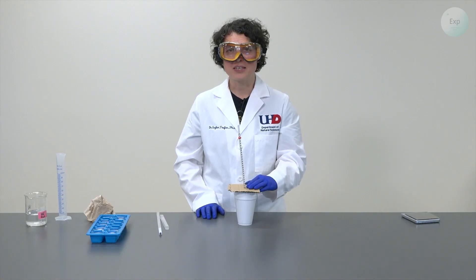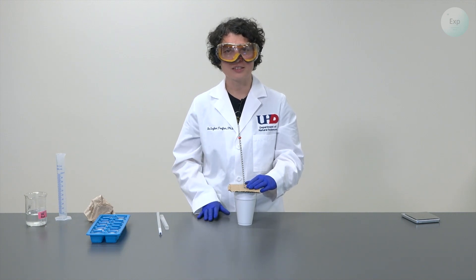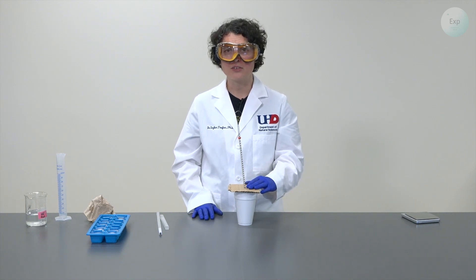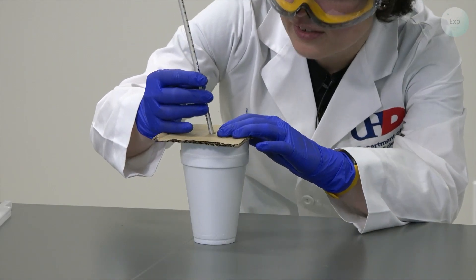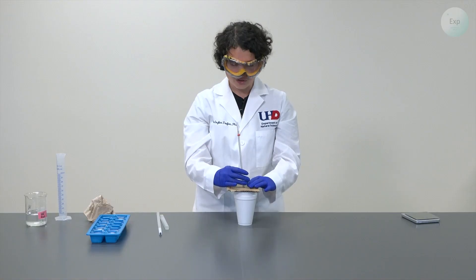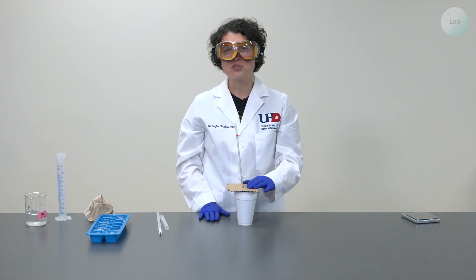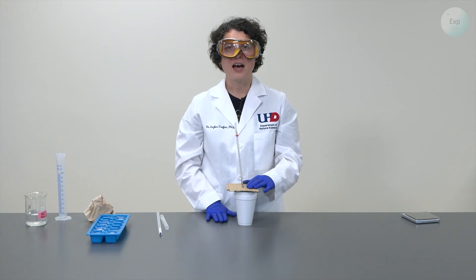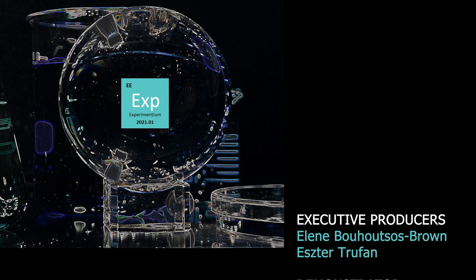It has been approximately 10 minutes of me tracking the temperature of my ice and water blend inside the cup, and my ice cube is now fully melted. It is time to record the final temperature of the water inside the cups. The final temperature is 5.4 degrees Celsius. From this information — the mass of water, the mass of ice, the initial temperature of the water, and the final temperature of the ice and water combined — I should be able to determine the enthalpy of fusion of ice.